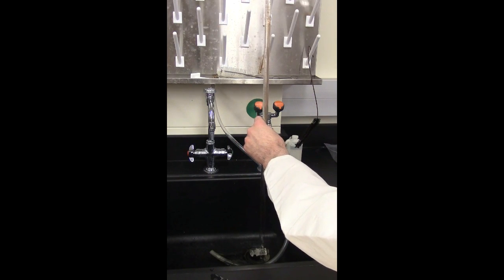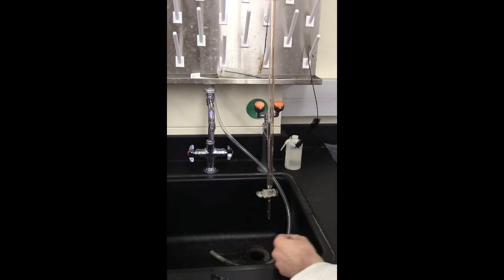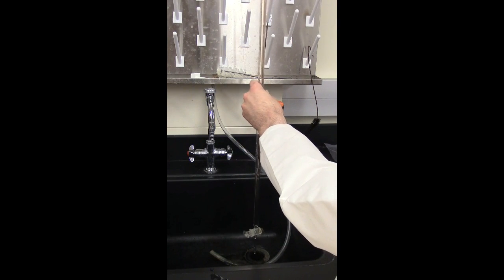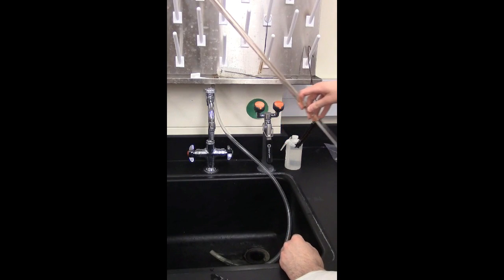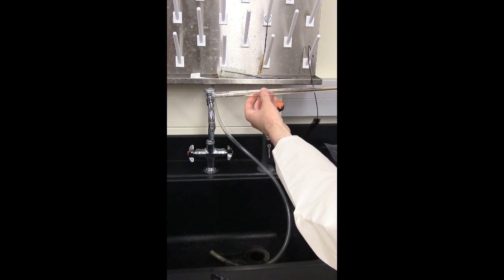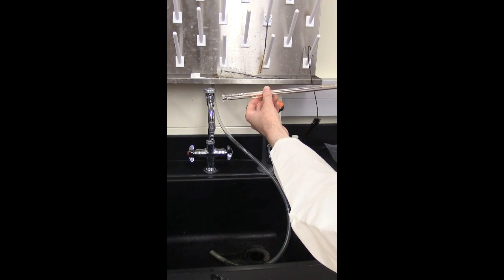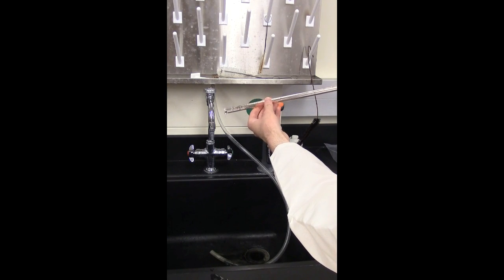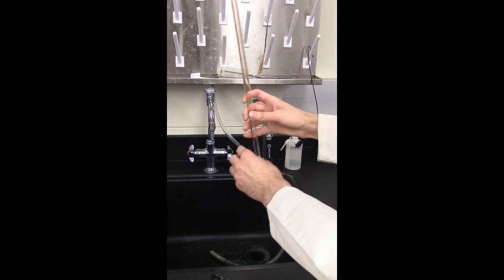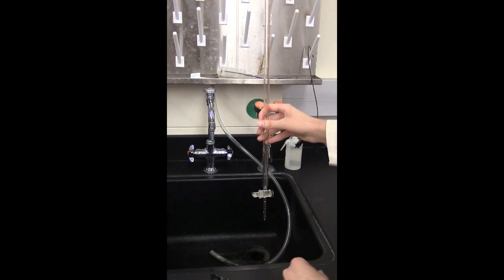Pour in a little bit, not very much. Then what we'll do is we'll tilt this and pour some out. And we tilt it and rotate it such that the liquid will coat the entire inside surface of the buret. This will prevent any contamination from previous experiments.